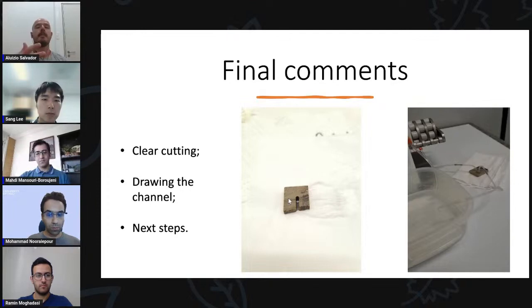And it was already quite challenging because we don't want to involve a process with chemical lubricants or resins or glues to fix it, because we are going to make chemical analysis. A chemical lubricant would contaminate our sample, so we wouldn't be able to see the reactions that we want. Also, we want to avoid the polishing process on the surface for the same reason of contamination.